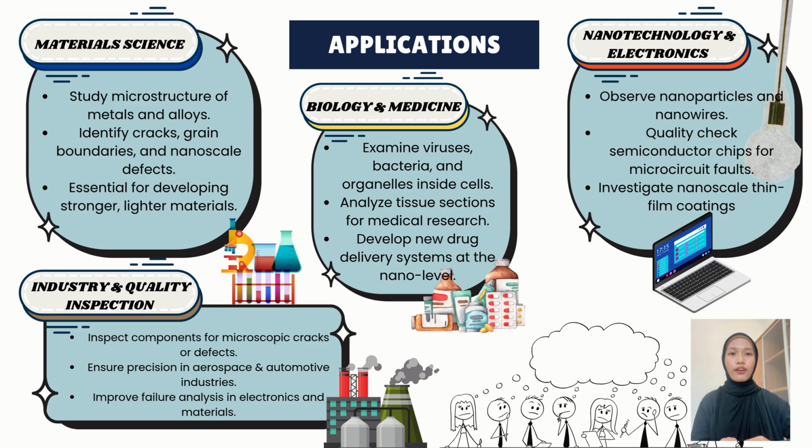And third, we have nanotechnology and electronics. This microscope helps check tiny chips and nanostructures. Even the smallest fault can cause problems. So this is the key for making sure our phones, computers, and devices work perfectly.